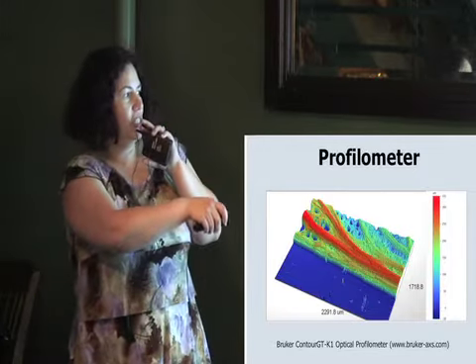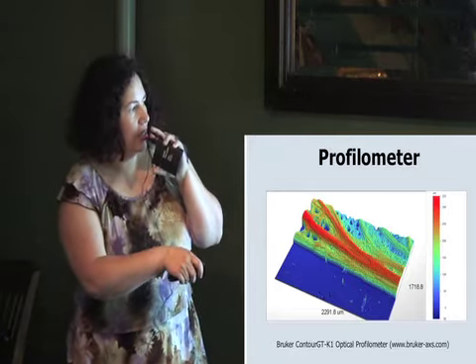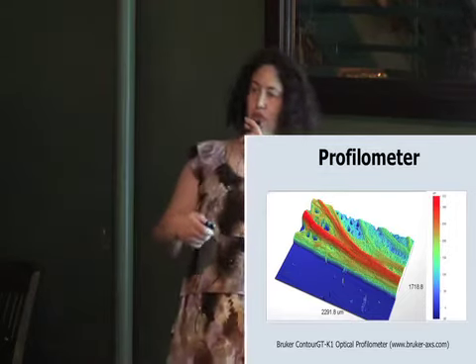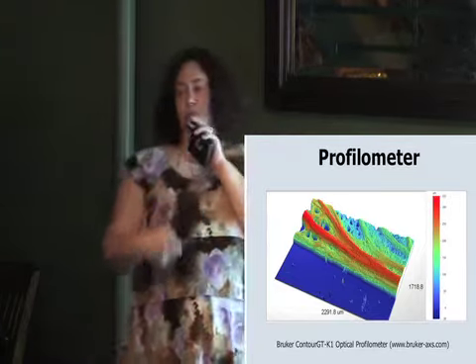And this is another detail of a vein. Now we got a little bit closer, and we can see how the surface is smooth, which we cannot usually see by naked eye. And sometimes it's very hard also to detect the smoothness with an optical microscope. So we're mapping here the surface.